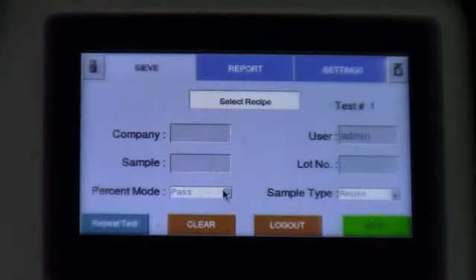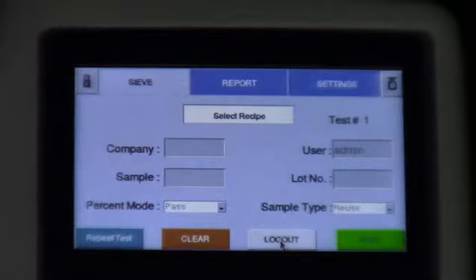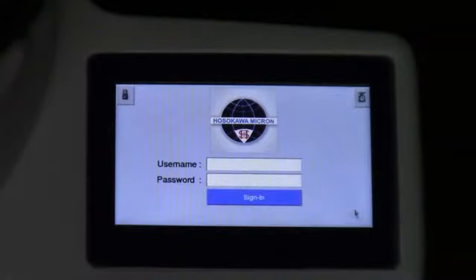One of the many reasons you would connect to a network is so that you can search for printers on that specific network. Or via Wi-Fi, as I mentioned before, printing is performed via Wi-Fi. Log out. Whoever is logged in can log out at this point and then allow the next person to log in.